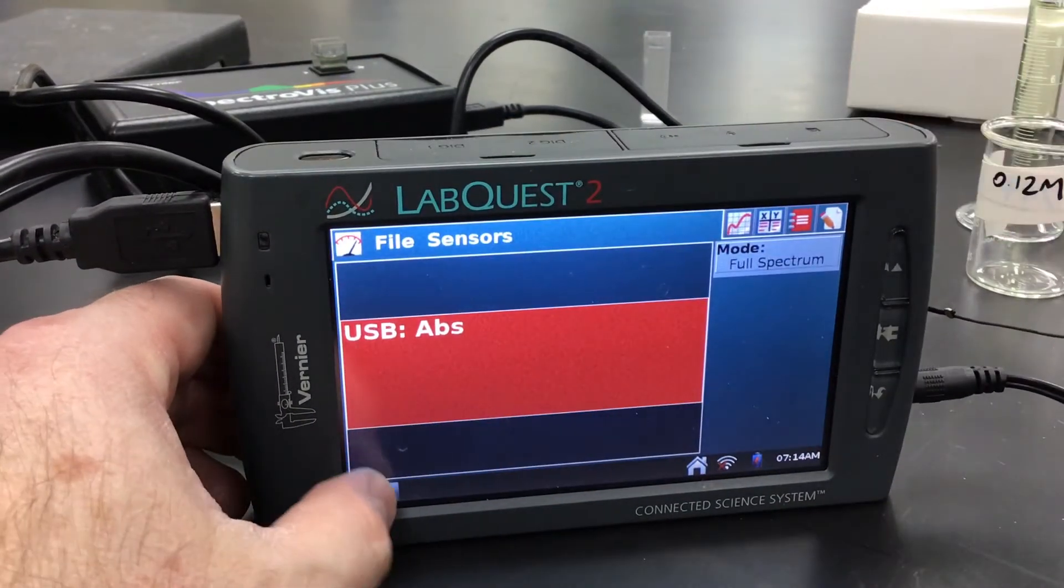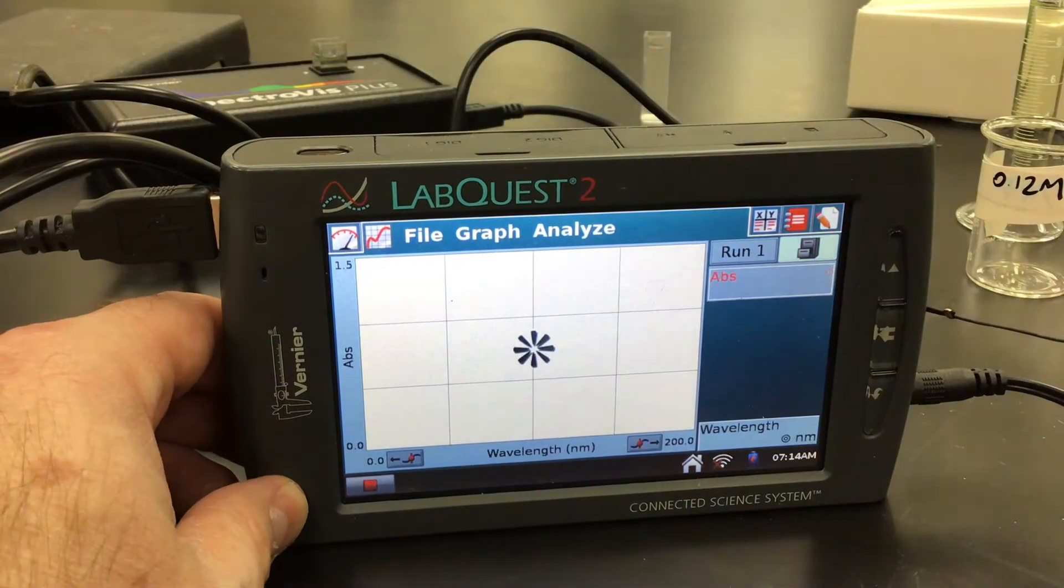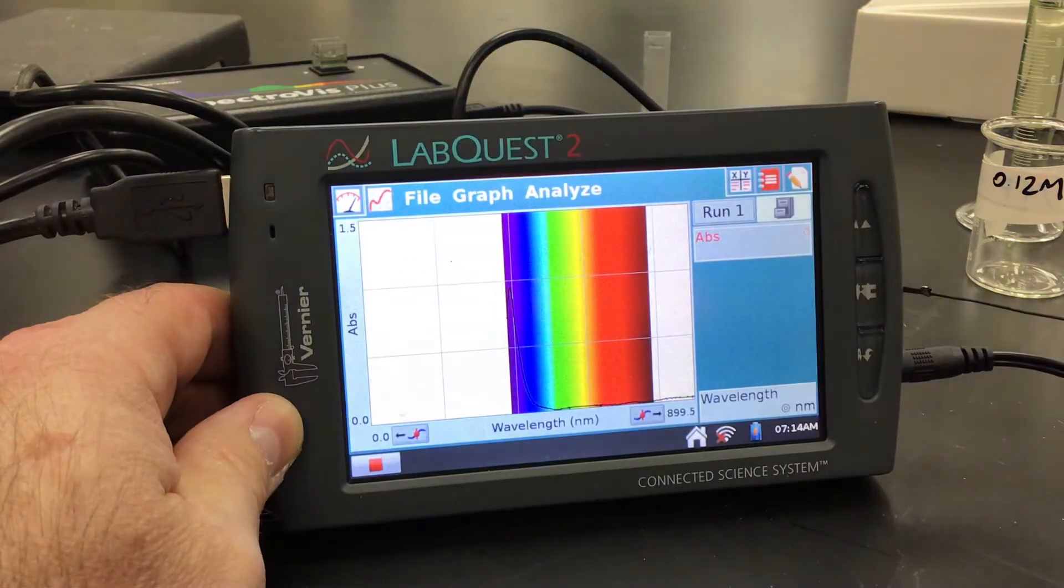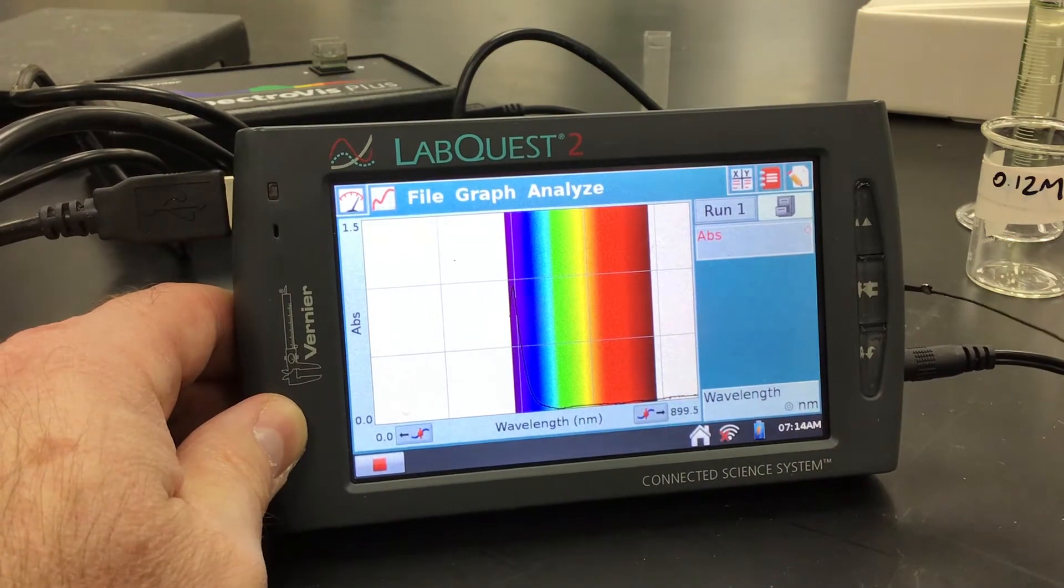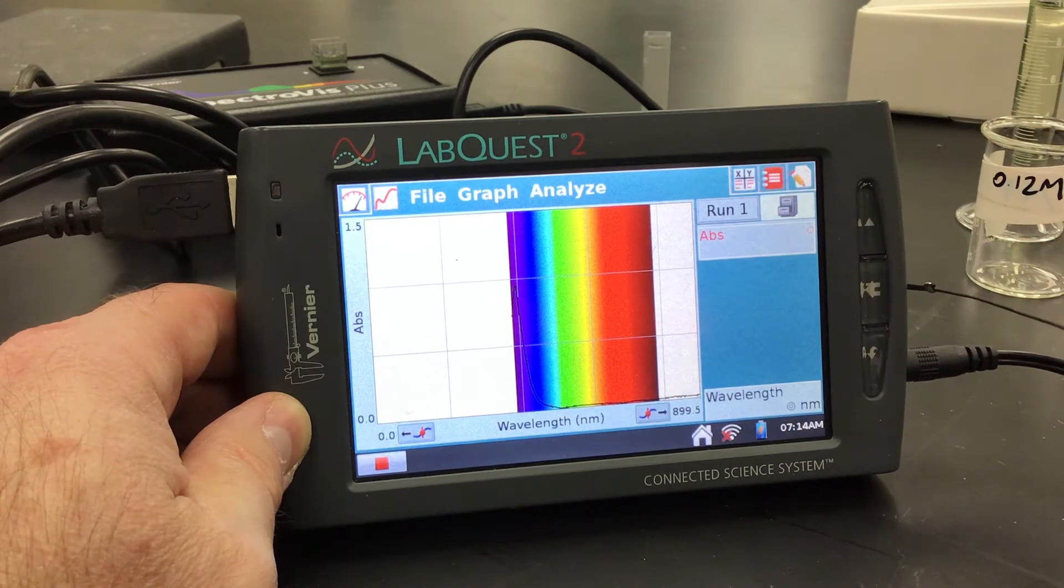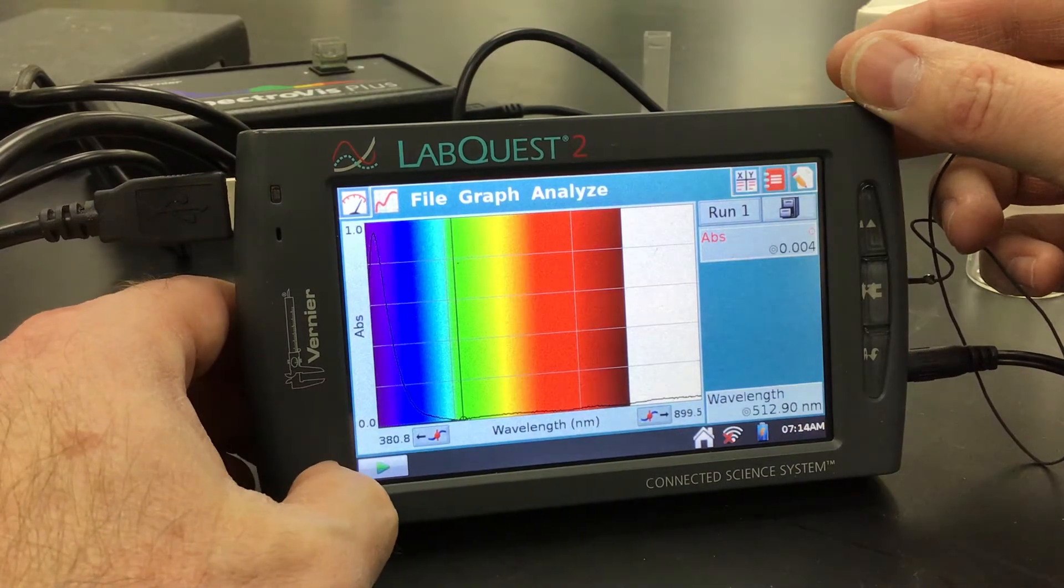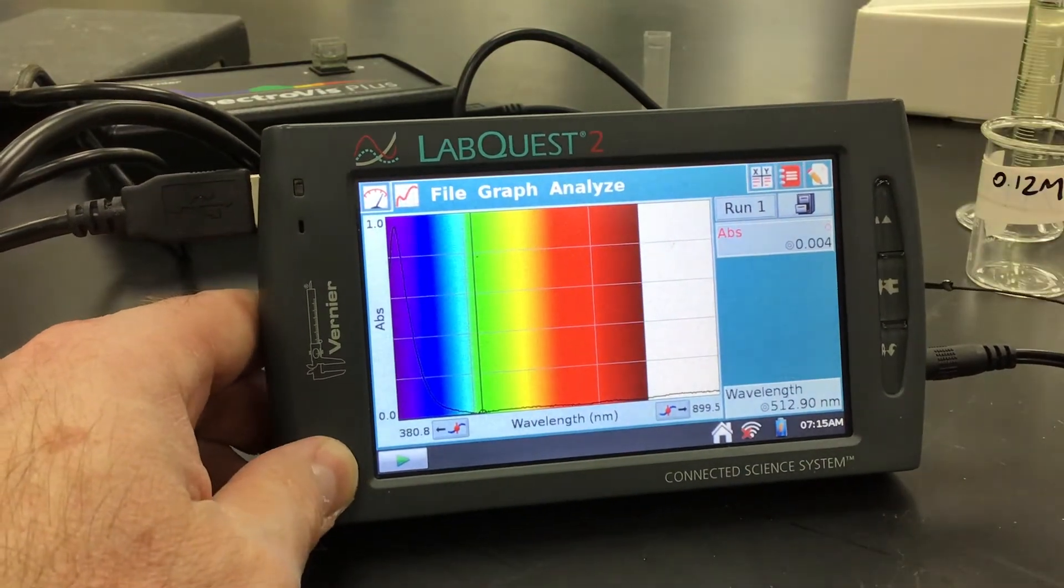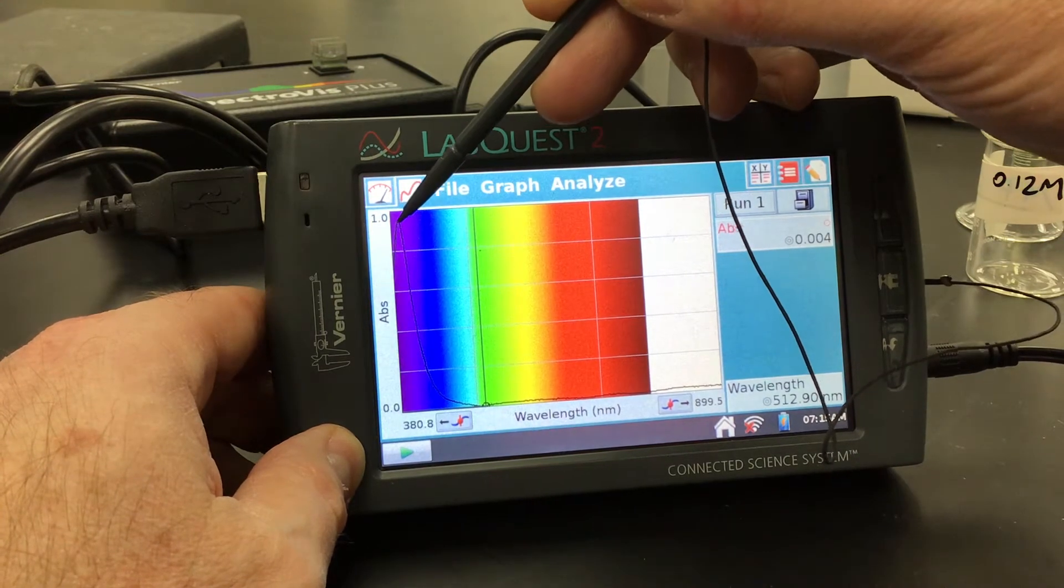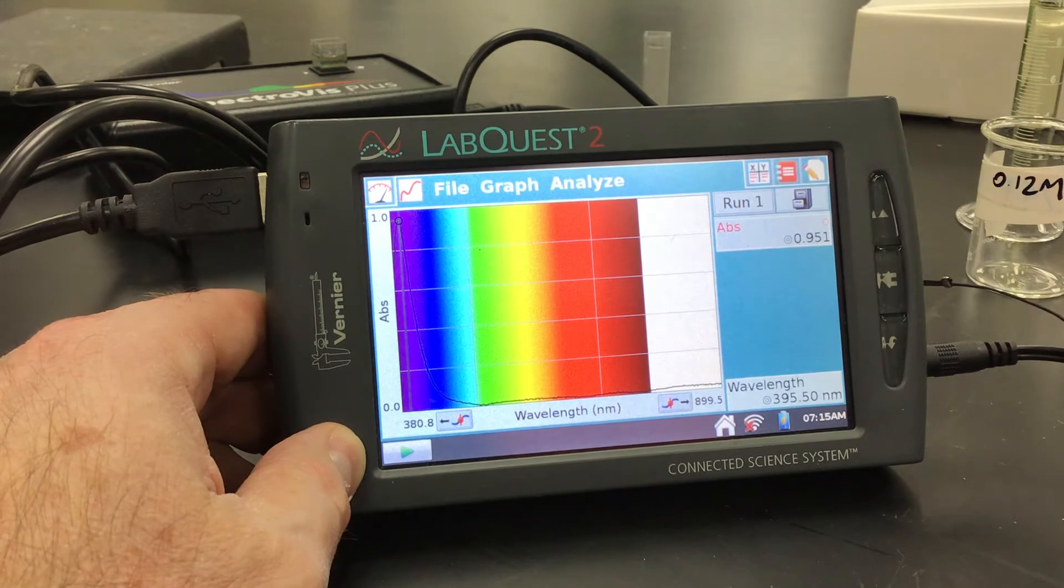And I'm going to go ahead and start collecting our data. And we're going to see a peak over here kind of in the blue range. I'm not sure why my graph is all squished, but these things are weird sometimes. I'm going to go ahead and stop collecting my data. And there we kind of auto-scales. And so what you can see is that our peak is over here in the blue, right around there. But we are not going to be collecting our wavelength there.